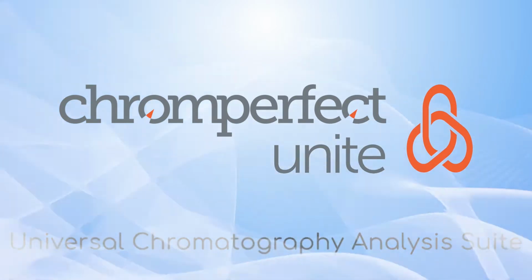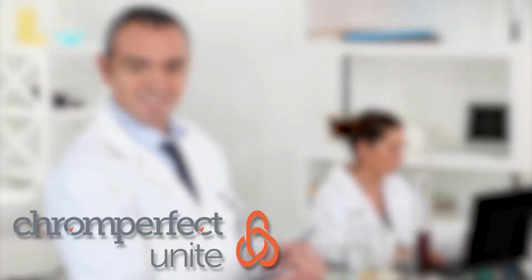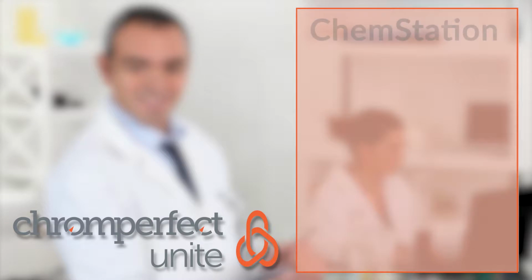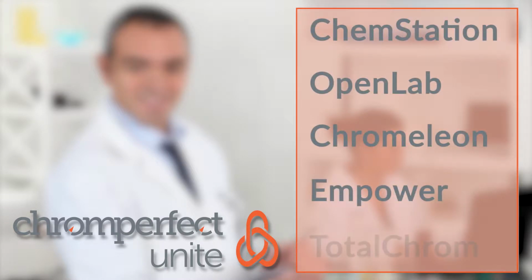Chromperfect Unite is a new software platform for the analysis and reporting of chromatography data. Unite can accept data from Chromperfect and third-party acquisition systems such as Chemstation, Openlab, Chromeleon, Empower, TotalChrom, and others.